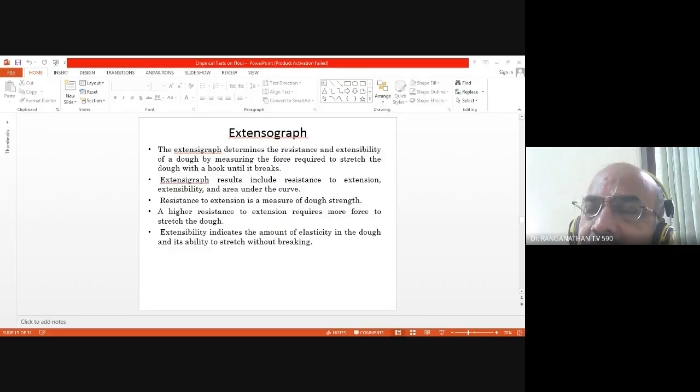Why is it important? In the case of bread manufacture, the most important thing is the gluten structure and the strength. Now, in the case of farinograph, you see the maximum ability to hold on, the ability to maintain the structure, and the point at which the dough crumbles.